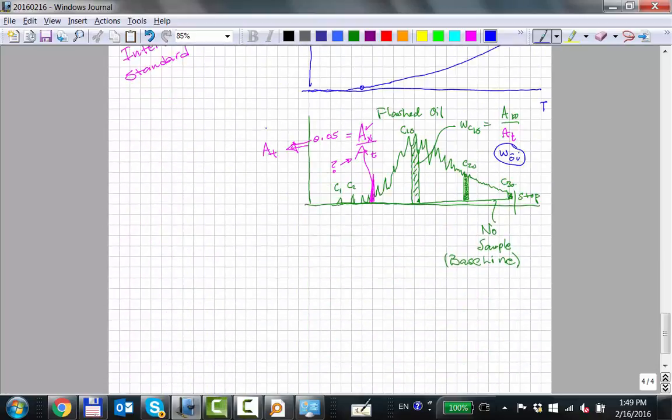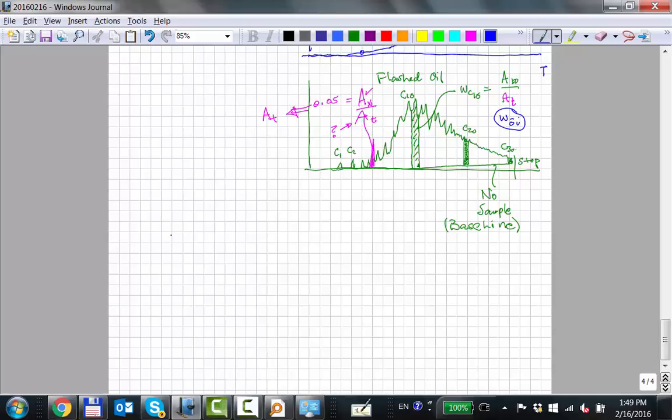So what's done is that from this flash gas-oil ratio, you can basically get the mass of the gas and the mass of the oil by calculation. And then because we know the composition of this, we know all the components and their molecular weights, we can calculate the moles that became gas.